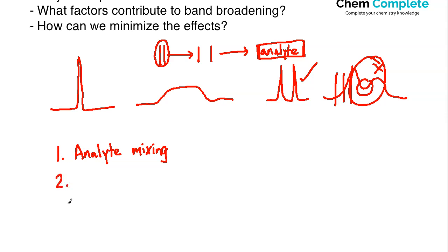And so number two, one of the other issues here, whether there's a crossover between analytes or not, is it could potentially lead to the inability to quantify your results properly, okay? So inability to, and I'm just going to put quantify here. Remember, quantify means to use numbers. And so if we're talking about the broadening effect here, it may lead to issues where when you're trying to analyze your individual analytes that have been broadening to a severe extent, you're not really going to be able to quantify them properly relative to other analytes in the mixture.